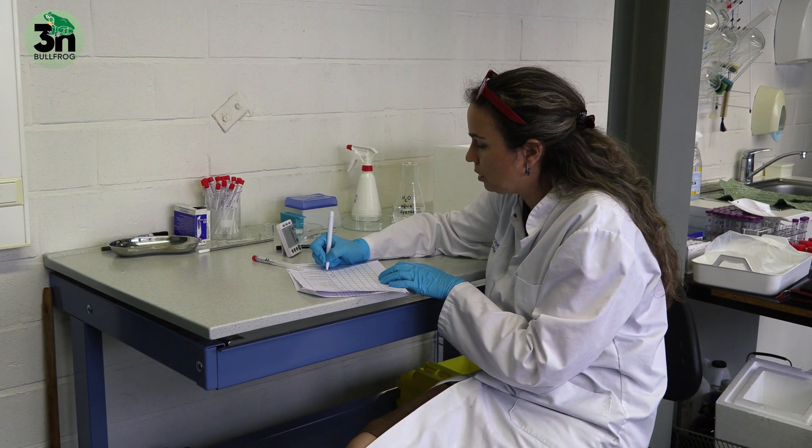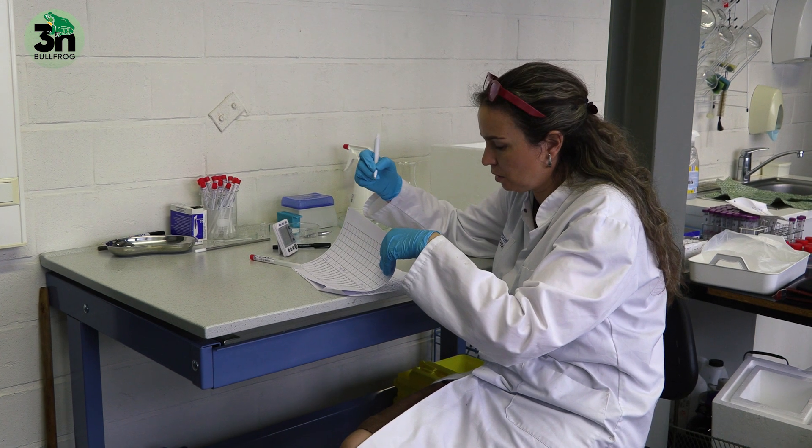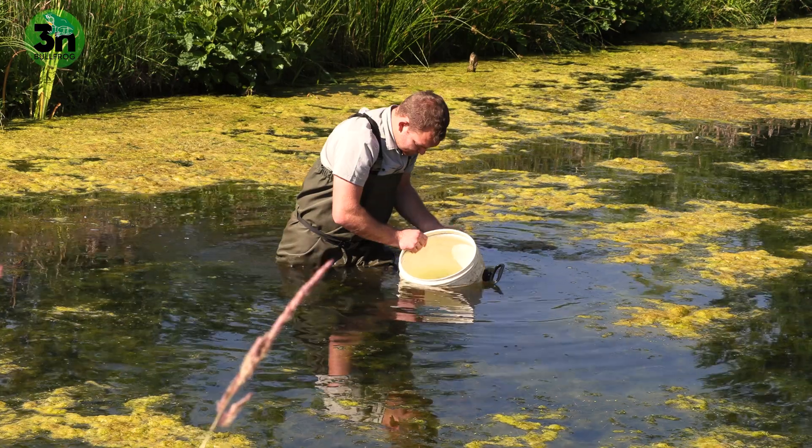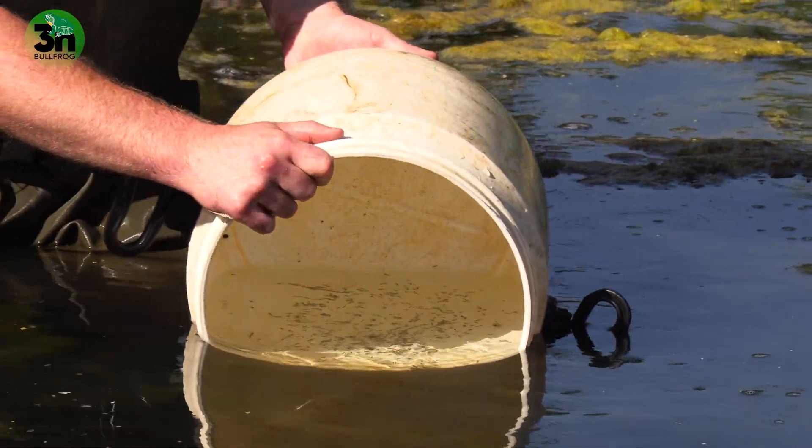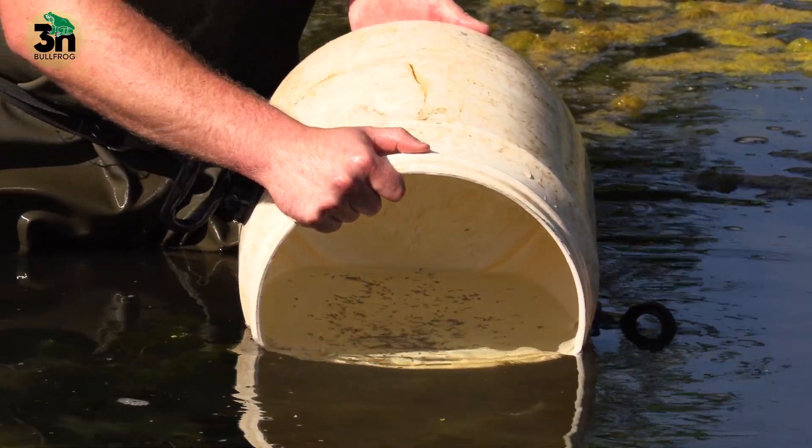From every batch we breed we keep some larvae in the freezer to determine the ploidy level. This is important to determine the amount of triploid or aneuploid individuals in the batch. The larvae stay two years in the enclosures and then they metamorphose to young bullfrogs.